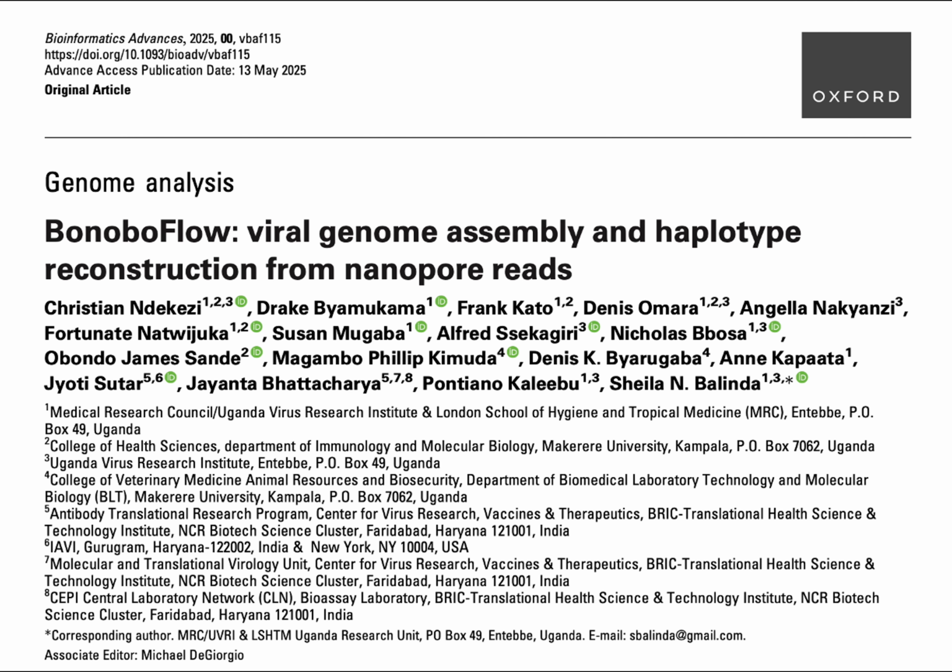Okay, so how does Oxford Nanopore Technologies, ONT, fit into this? You mentioned them too. Right, ONT. It's really gained a lot of traction, partly because it offers a more accessible route. The sequencing cost is relatively lower. Okay, the bank for less. And crucially, its long reads are excellent at spanning those larger genomic repeats and complex structures that really trip up the short read methods. That capability is a significant advantage.